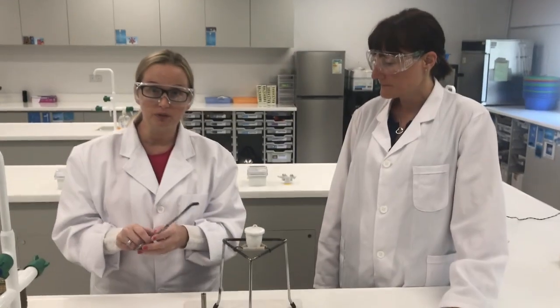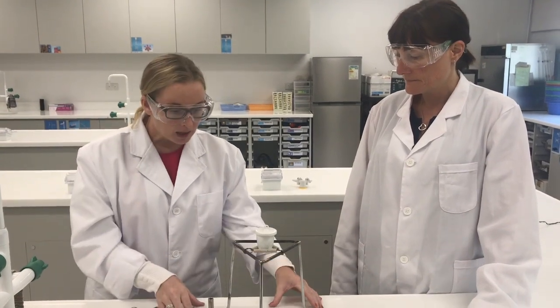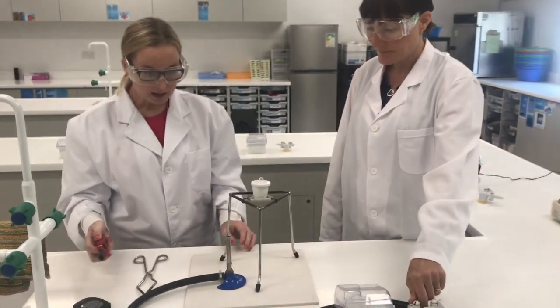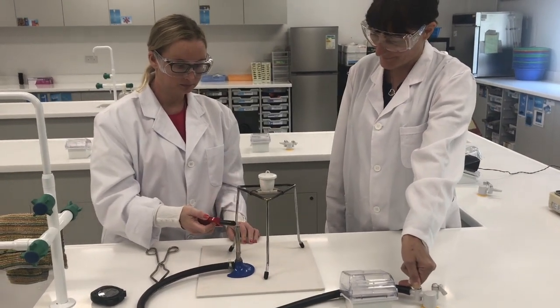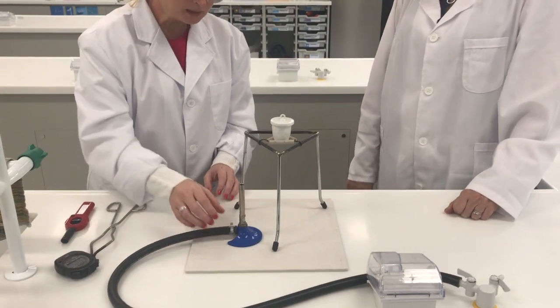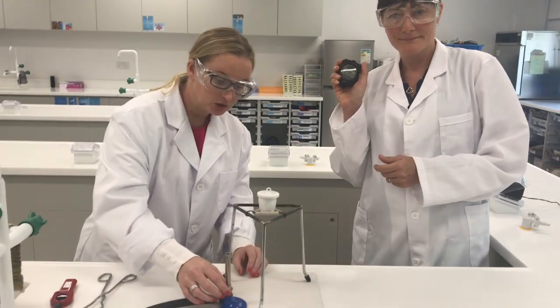Once you have practiced that and feel confident with the tongs, you are then going to light the Bunsen burner. Make sure it is lit first with the safety flame. You are working with your partner, so you can give your partner the stopwatch.